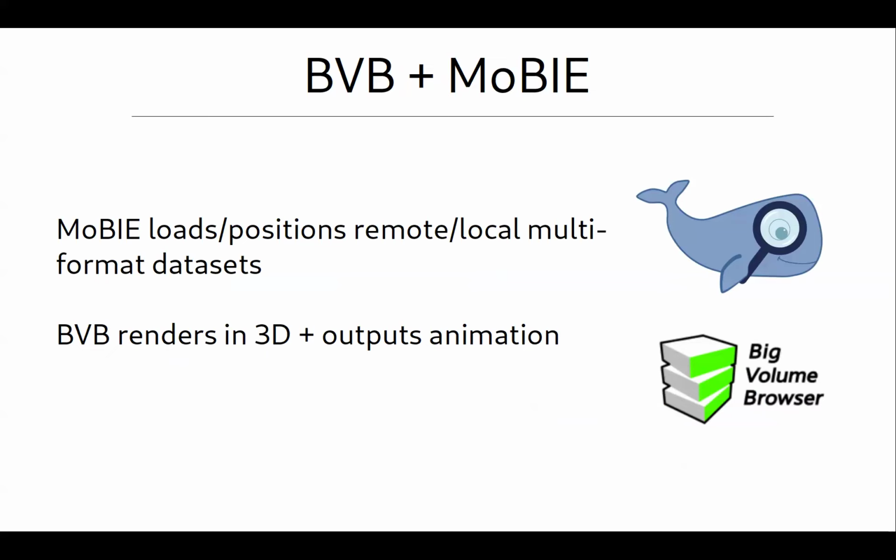Yeah, so this is the part where Christian comes in. This is where we did the integration of BigVolumeBrowser with Mobi. Mobi, I hope some of you know and use it. You should. I don't see any excuses since you're at EMBL, right? It is an amazing viewer for remote datasets, all modern formats. You can align them, store the settings, and load a lot of different data from EM and spatial transcriptomics. So now almost all of these objects you can add to BigVolumeBrowser, and you can create movies, animations, and renders of the scenes.